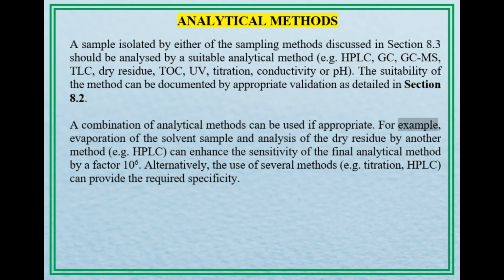For example, evaporation of the solvent sample and analysis of the dry residue by another method, for example HPLC, can enhance the sensitivity of the final analytical method by a factor of 10^6. Alternatively, the use of several methods, for example titration, HPLC, can provide the required specificity.